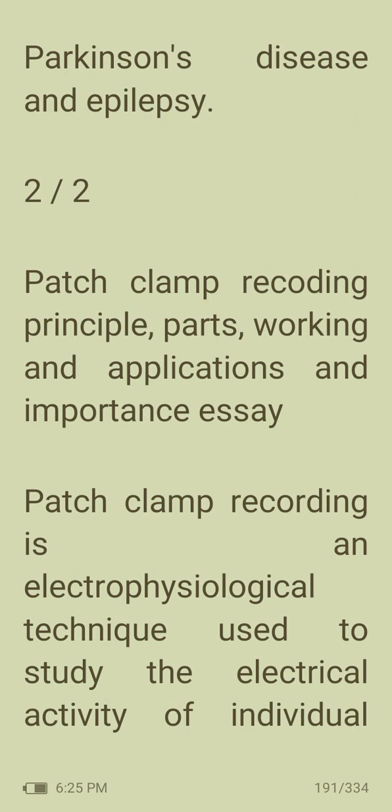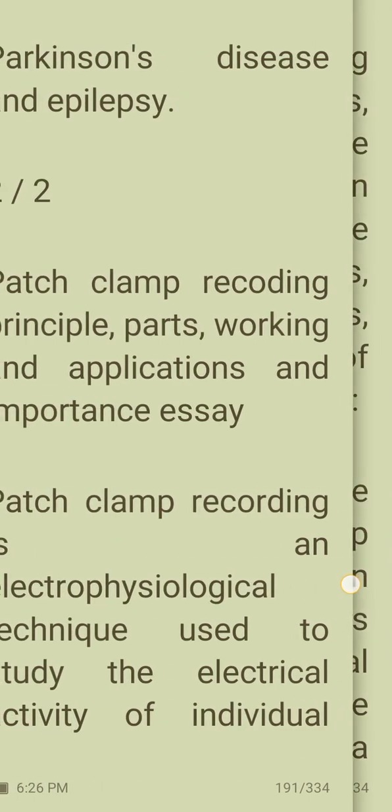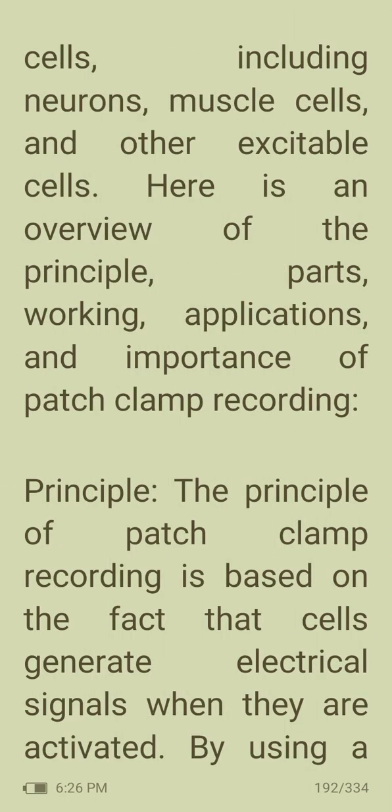Next one is the patch clamp recording, its principle, parts, working, applications and importance. So what is a patch clamp recording? Patch clamp recording is an electrophysiological technique used to study the electrical activity of individual cells, including neurons, muscle cells, etc.